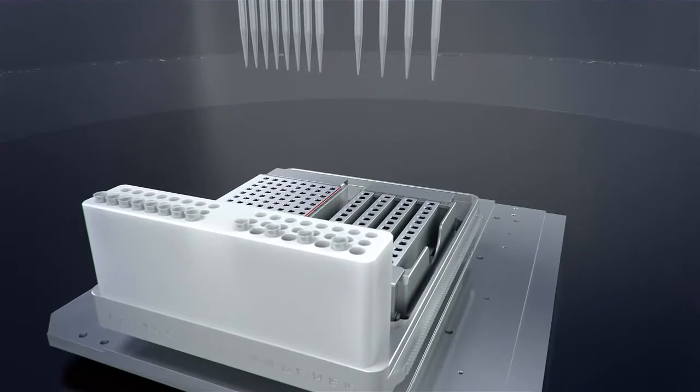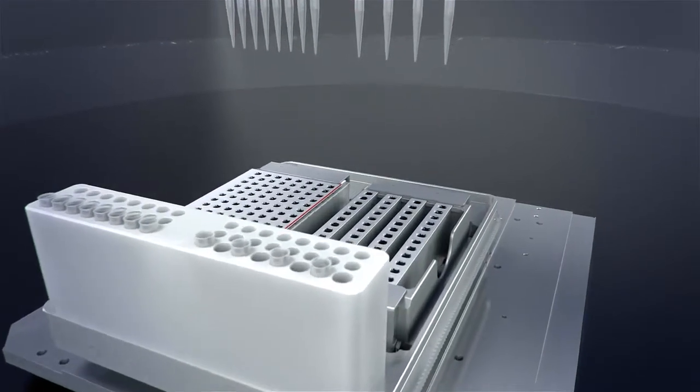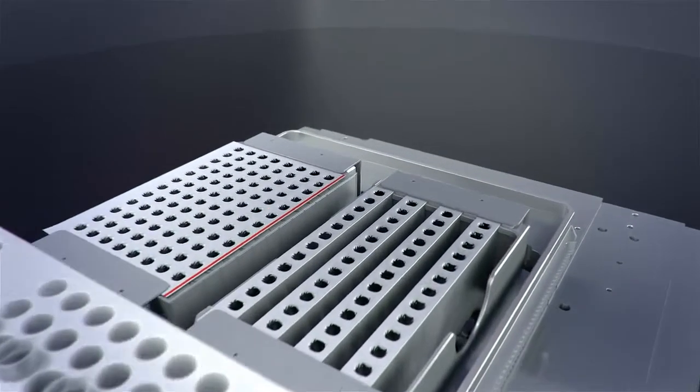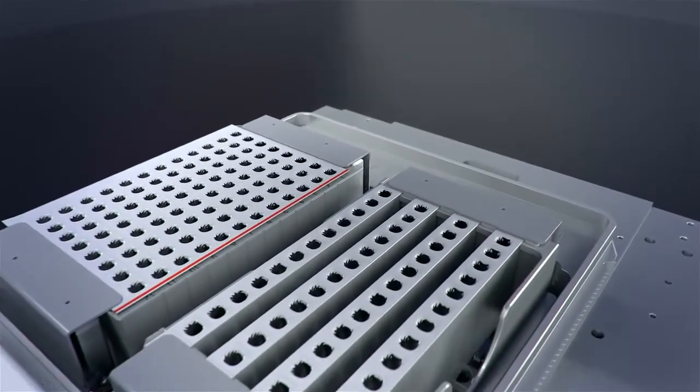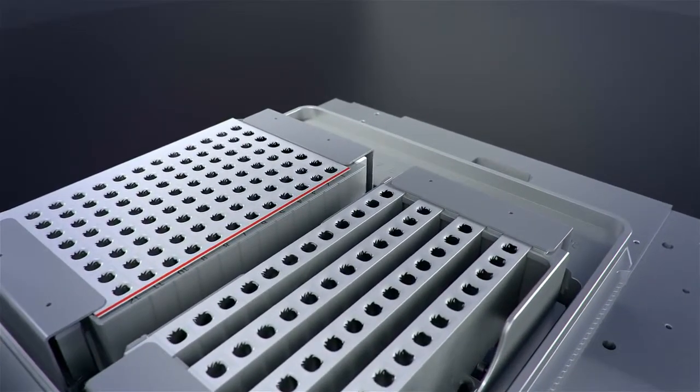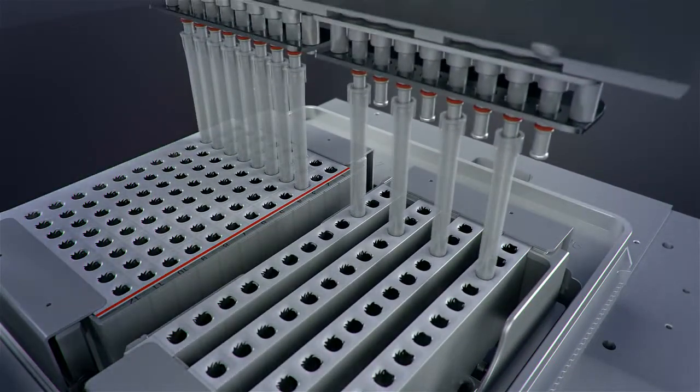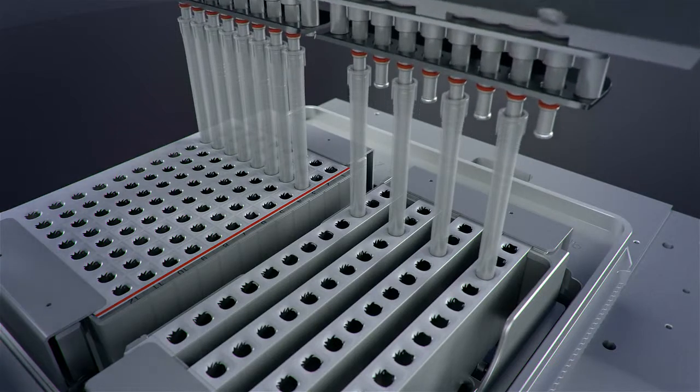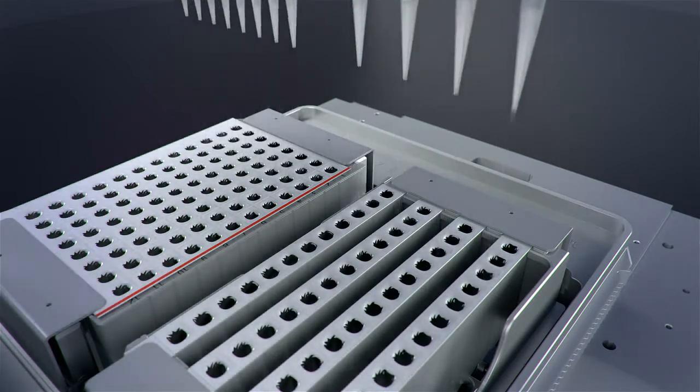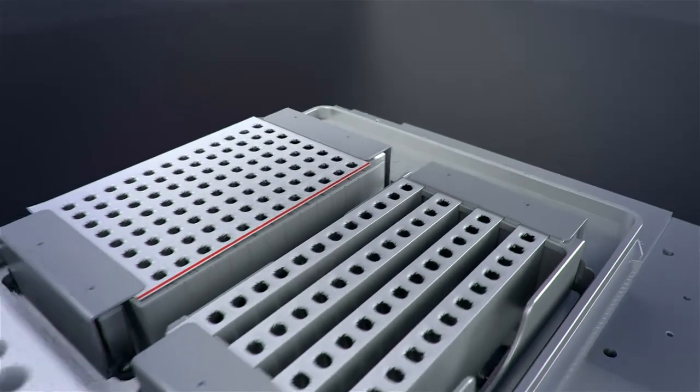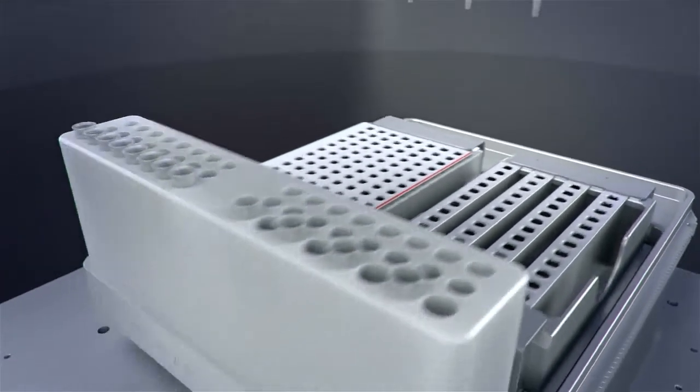Following the purification process, the nucleic acids bound to magnetic particles are eluted in a low-salt buffer. The eluate is then automatically transferred to a separate tube, either for storage or for additional applications.